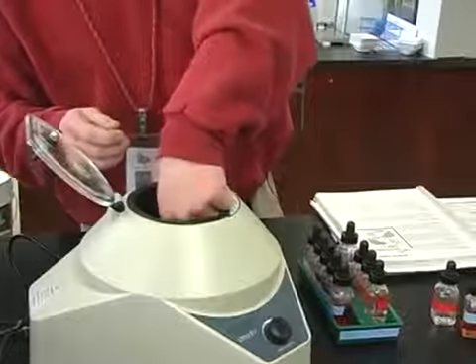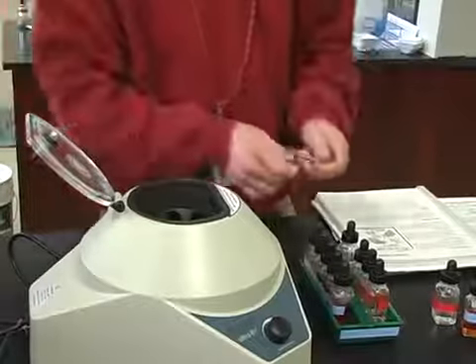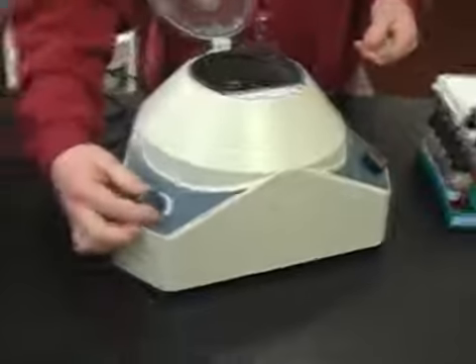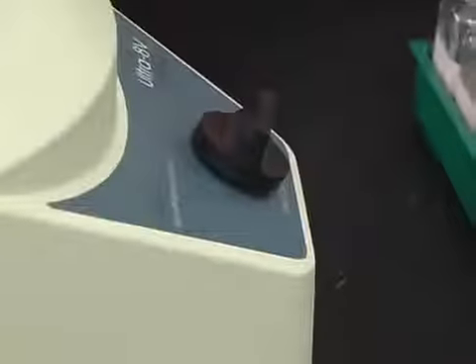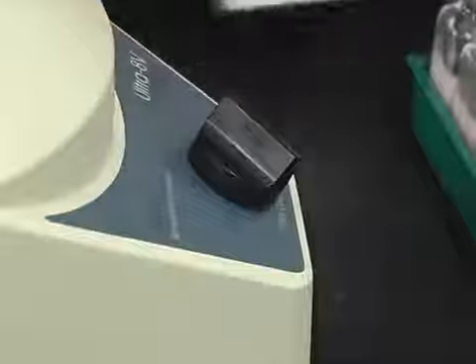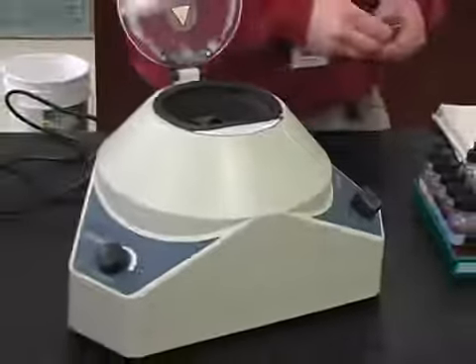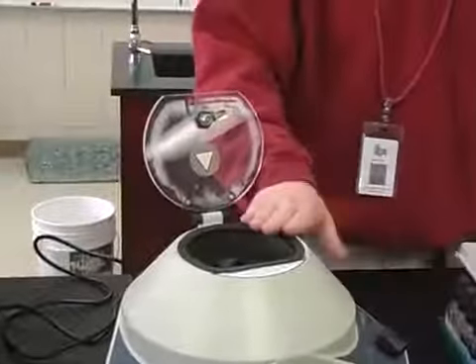When you do run the centrifuge, there's a couple controls on here to show you how to operate it. This is the speed control right here, and then this is the timer. The timer actually makes a ticking noise if you listen really carefully. And then when it's done, it makes a neat ding. But to make the centrifuge run, you have to engage the cover. It won't run without the cover attached.